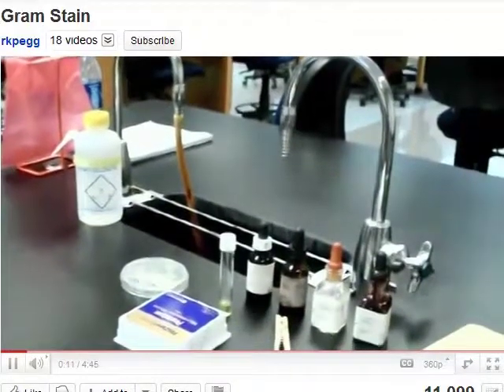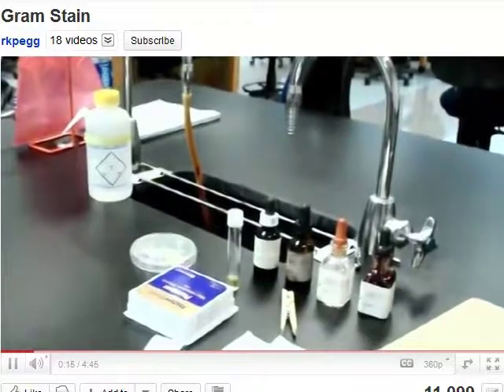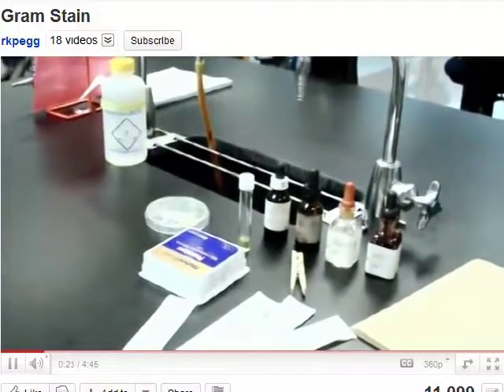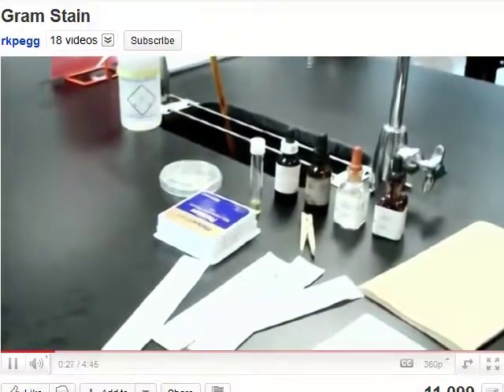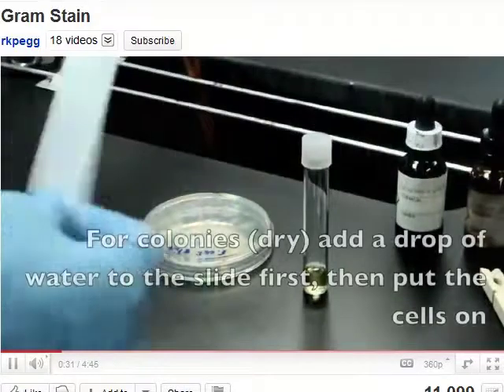In this short video, we're going to take a look at gram staining. Now, the materials you're going to need are clean microscope slides. They may have to be cleaned with a methanol pad before we use them. We're going to need our gram stains, and we should get everything ready before we begin. Of course, we need a specimen and something to apply the specimen with, lots of paper towels and distilled water.